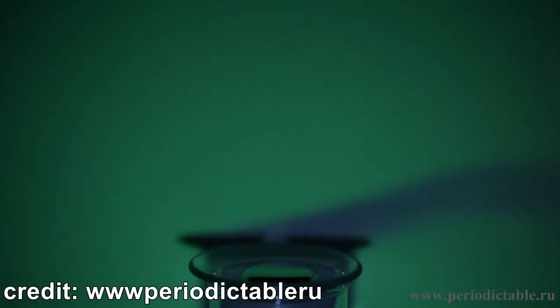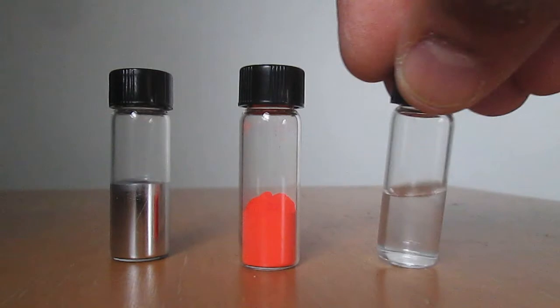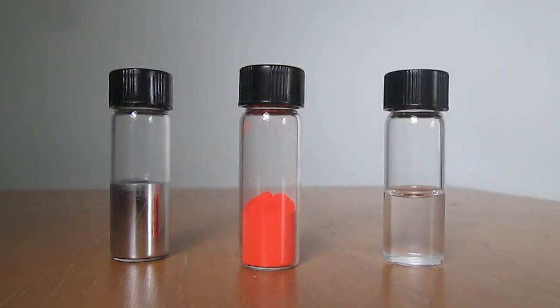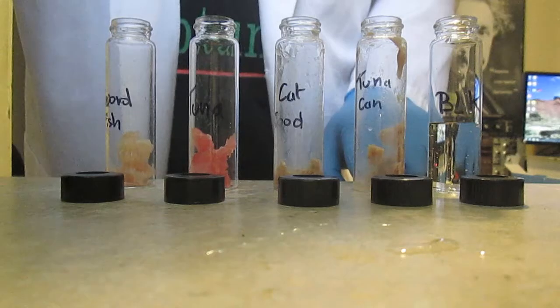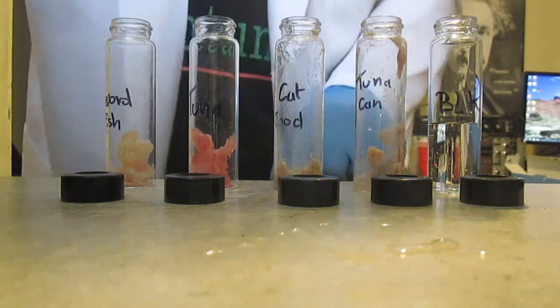Mercury in the environment can be found in three forms: metallic mercury, inorganic mercury, and organic mercury. However, only the metal can be detected with this setup, so a suitable preparation is necessary to level the playing field and get consistent results.